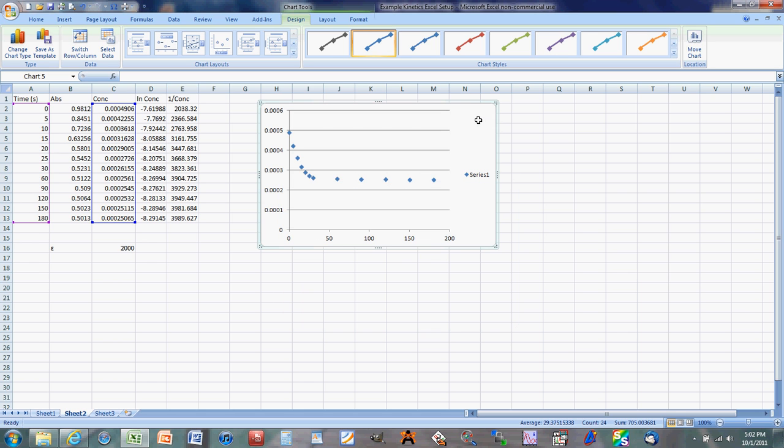Now remember, for the bleach experiment you want to find the initial rates. But to find the initial rates, you want to plot a tangent line through the linear portion of the graph, which, as you can see, you have a pretty linear portion here. By clicking, you can see this is where I see it end. This is the last linear point. This is at 25 seconds. So what you can do is go back over to your highlighted values over here and pull this up to get the linear portion.